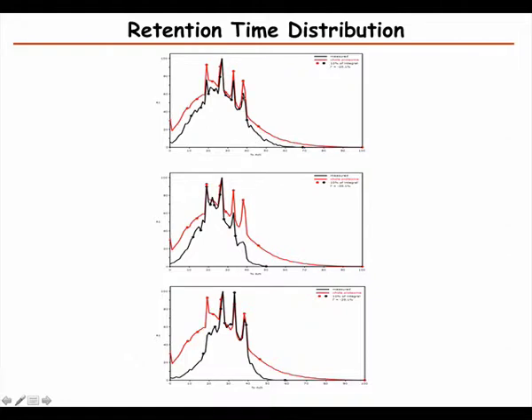But here we see quite nice, but we lose some of the slower peptides, of the hydrophobic peptides and a little bit of the hydrophilic, but otherwise we're doing well. But in other cases, we lose much more of the hydrophobic or much more of the hydrophilic. So that's something that the person that does the experiment can use as a tool to make sure that their experiment is well optimized.